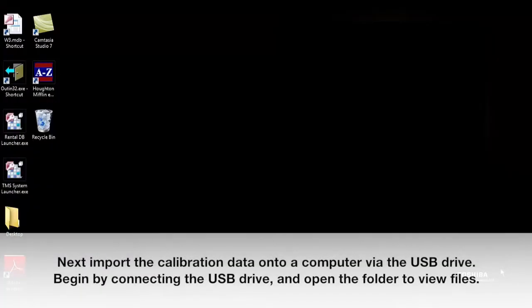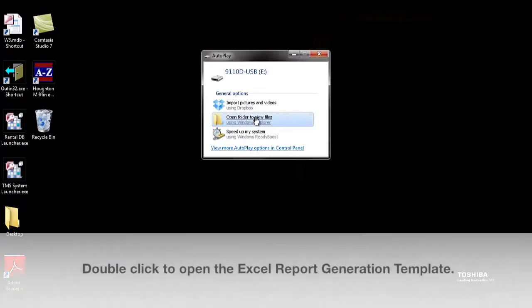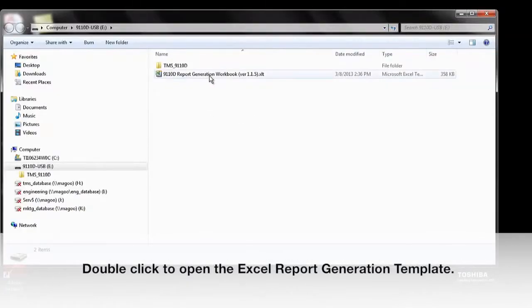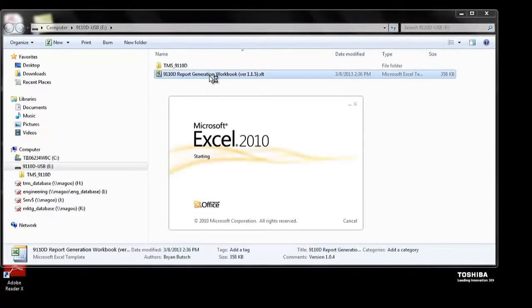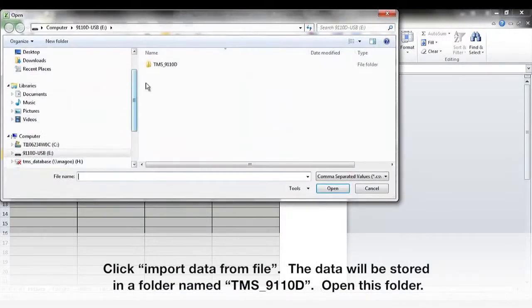Next, import the calibration data onto a computer via the USB drive. Begin by connecting the USB drive and open the folder to view files. Double click to open the Excel report generation template. Click Import Data from File. The data will be stored in a folder named TMS9110D. Open this folder.